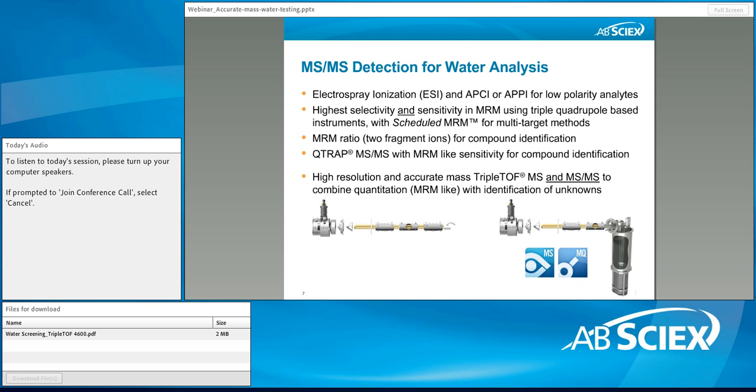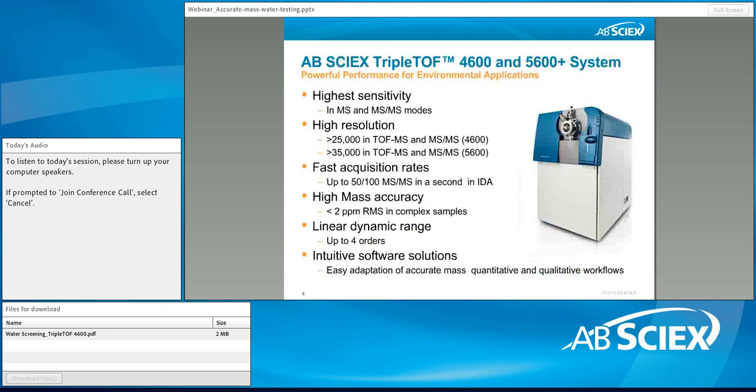Modern time-of-flight instruments can really quantify analytes with data quality and sensitivity levels like we know them from triple quadrupole instruments. And then in combination with MS/MS spectra, this allows us to identify whether targets or unknown compounds with very high confidence, and I will give you some examples later how that can be done.